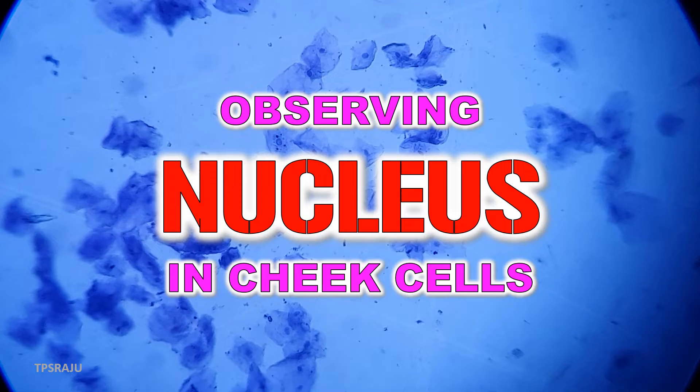Hi, good morning. Today we are going to observe Nucleus in Cheek Cells.